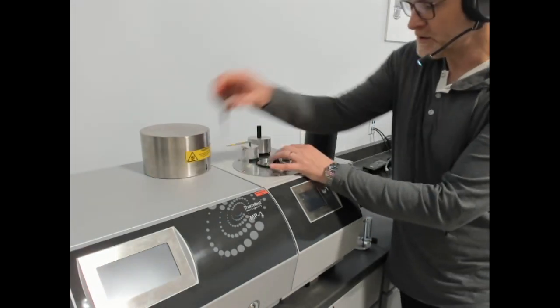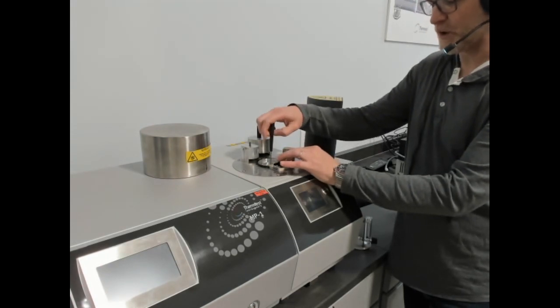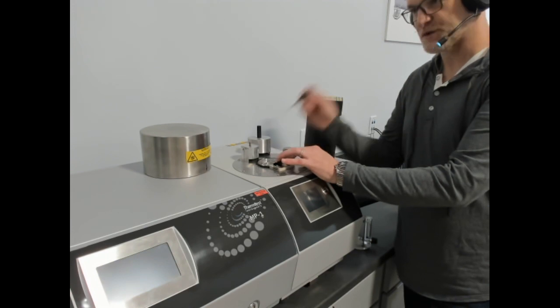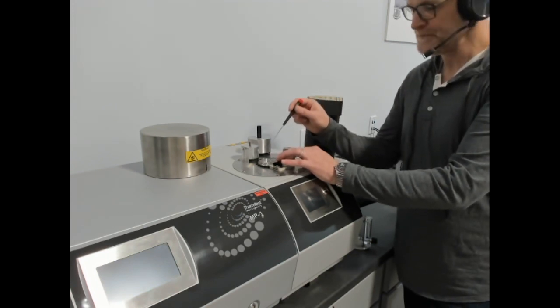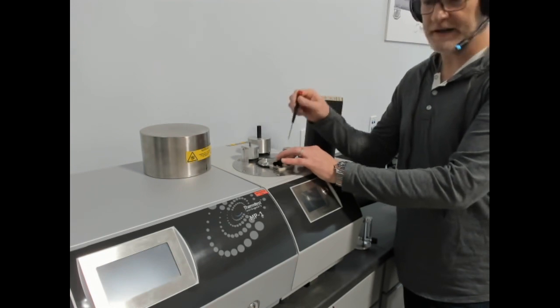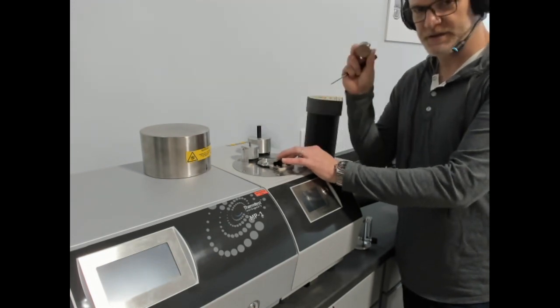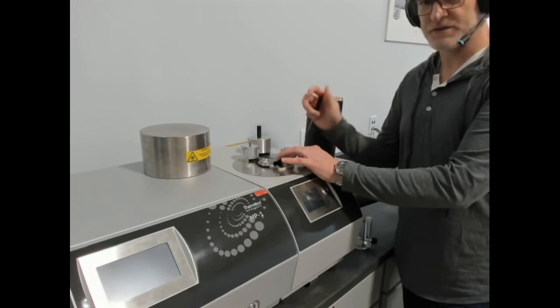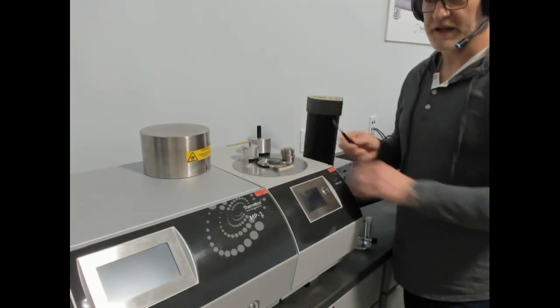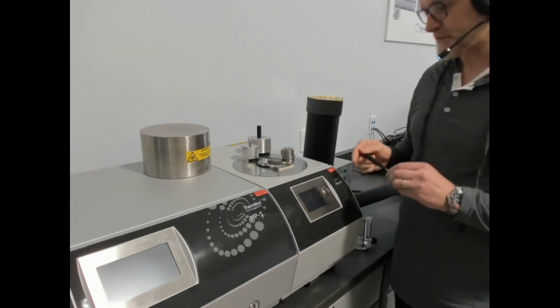The floor of the temperature platform can go up and down to accommodate different thicknesses. The maximum thickness on the temperature platform is 20 millimeters. The maximum diameter is 40 millimeters. Now, of course, it does not have to be a round sample, and it does not have to be a specific height. Those are just the maximum dimensions. That floor goes up and down to accommodate thin films and slabs and different shapes and sizes.